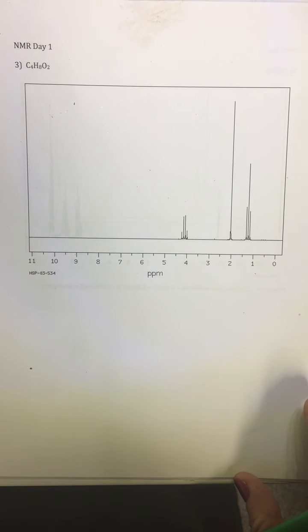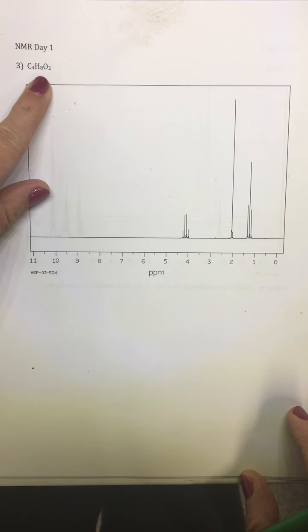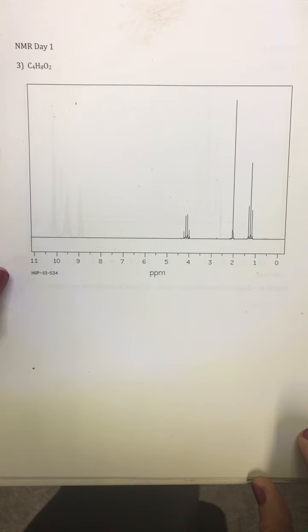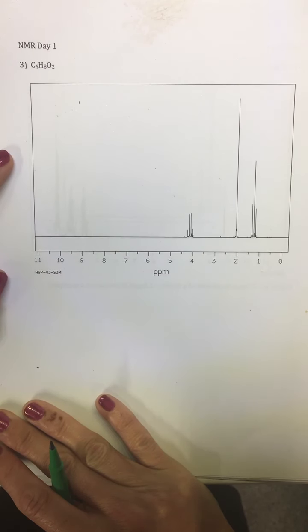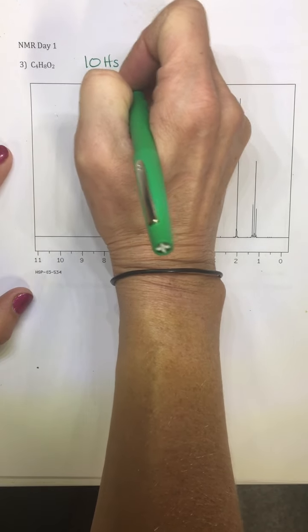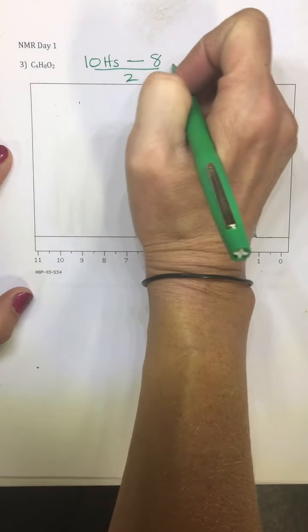Alrighty, so a little bit bigger of a formula. We have C4H8O2. Now I want you to go ahead and practice your degrees of unsaturation. So we've got 4 carbons, so 2N plus 2 for a saturated 4-carbon alkane would be a total of 10 hydrogens, minus the 8 that we have, over 2.